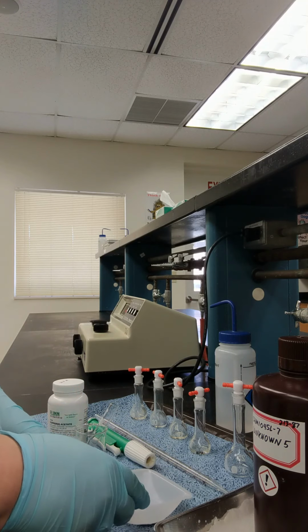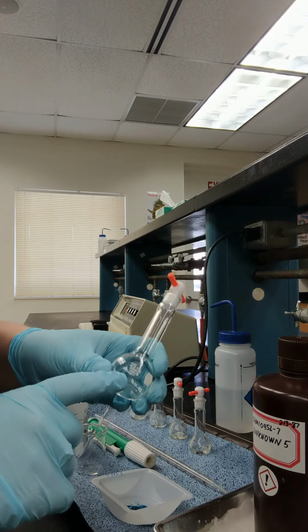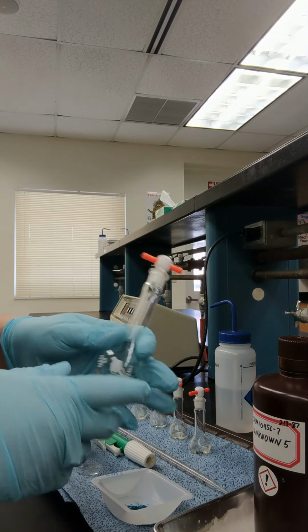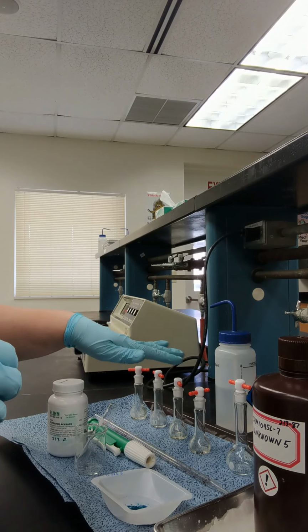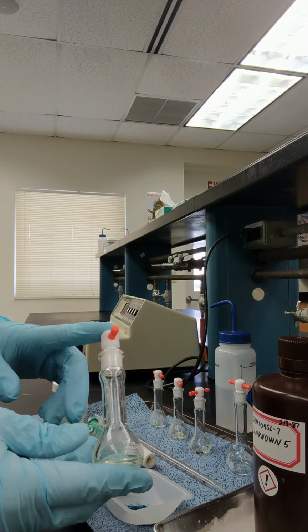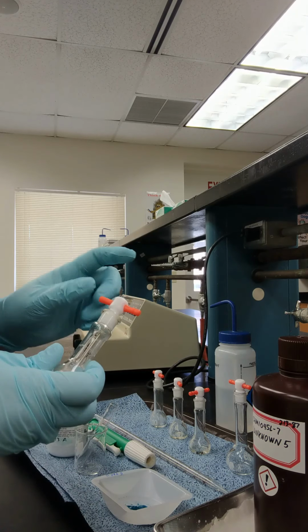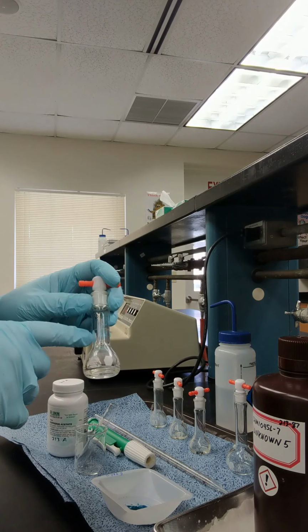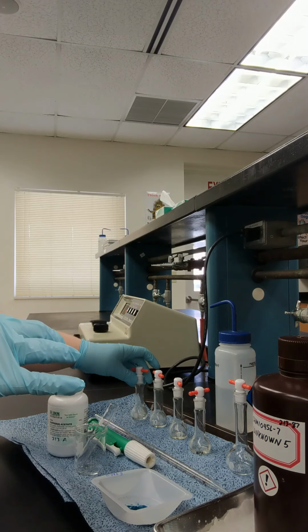All the things that we have here are the volumetric flasks. The first one has a total volume of 25 milliliters. This is the one that we're using for the stock solution. And then we have four volumetric flasks here, each one with a total volume of 10 milliliters. These are the ones that we're using to prepare the dilutions, which are the standards. Okay? So we're going to be measuring the absorbance for these four dilutions here.